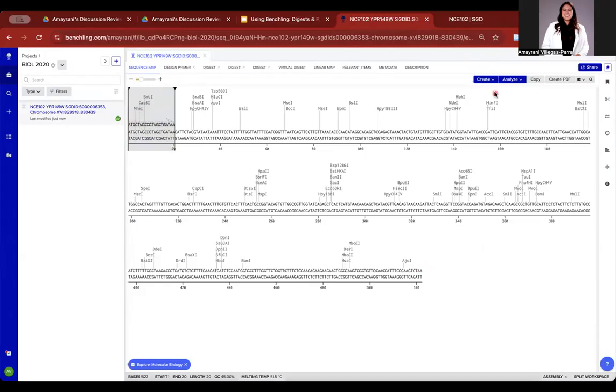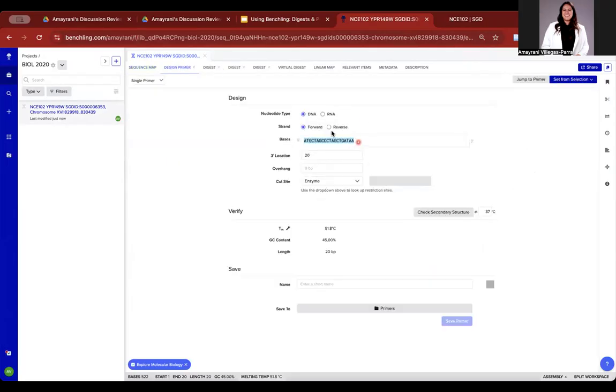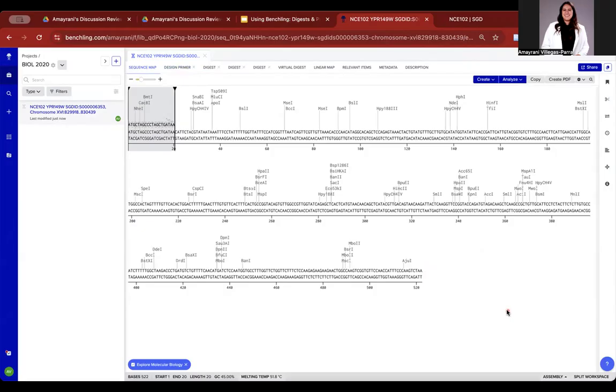All you would do is create it. Like I said here, primer, forward. So I already created it here, so I'm just going to click here, and I would just write this down for your problem set. That's what it is. Now, for your reverse, again, you have to consider your last 20, and you have to consider your stop codon. Usually in a lab setting, we don't include them.